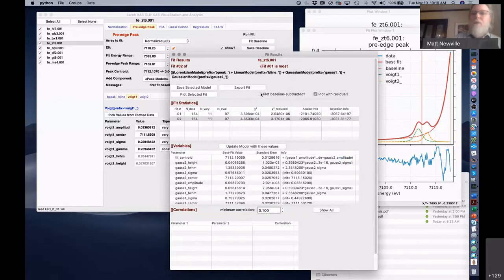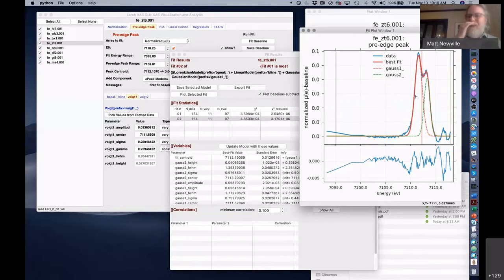So show me subtracting that based on those two peaks isolated, which in some literature, this is often what's plotted. And again, this could be tweaked. I'm not saying that is the best fit to that data. That's how you start with those analyses.